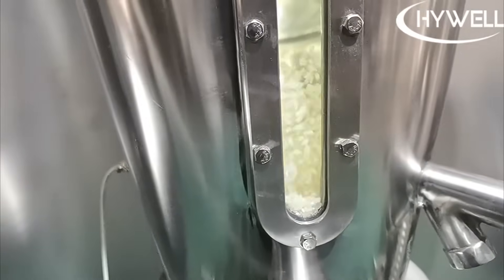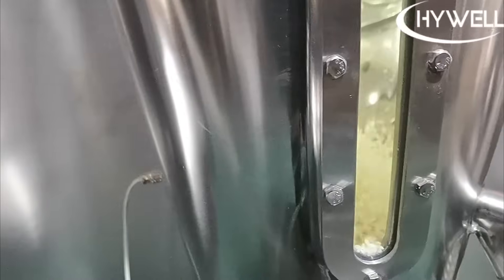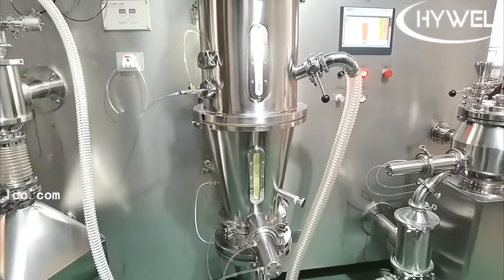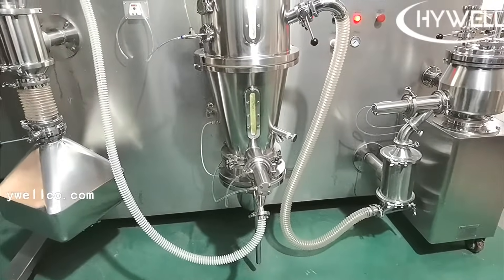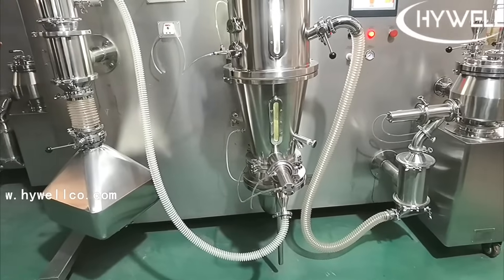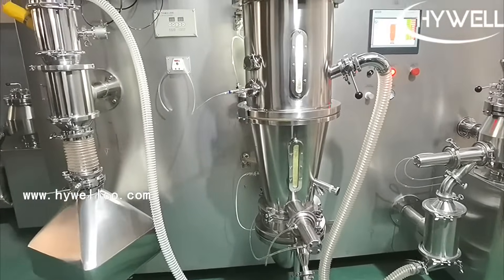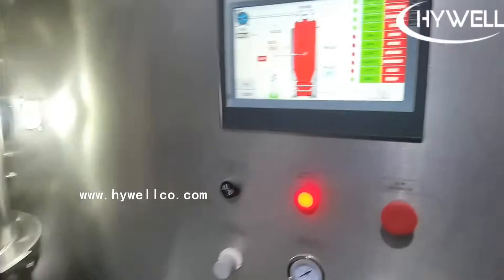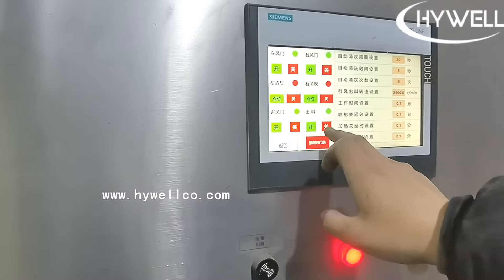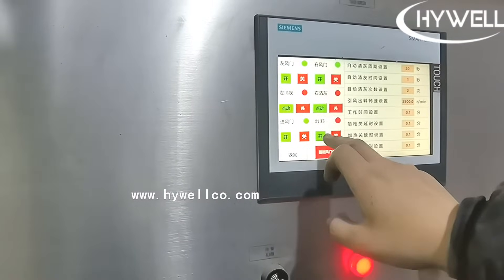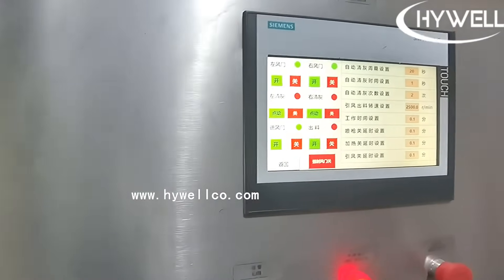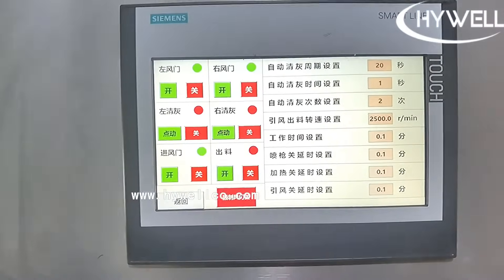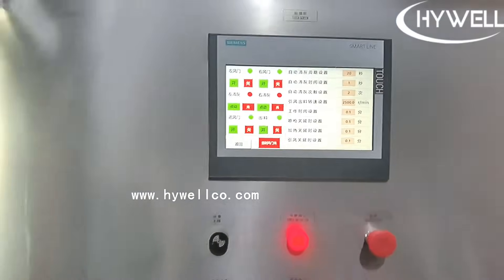The solid dosage granulation line from Highwell is a single-frame solution that carries out all options for the wet granulation process. It integrates the high shear granulator for mixing and granulation, the fluidized bed dryer for drying, granulation, and coating, and the conical and cylindrical calibrators for calibration. This helps reduce the space required in the clean room and minimizes the risks of cross contamination while giving maximum flexibility to process development and scalability studies.